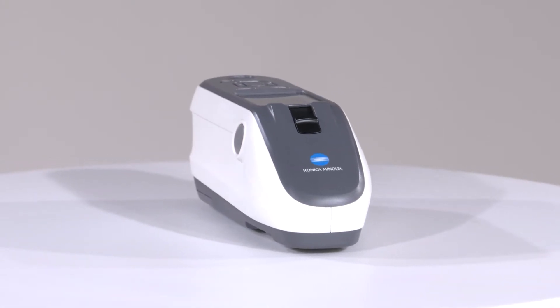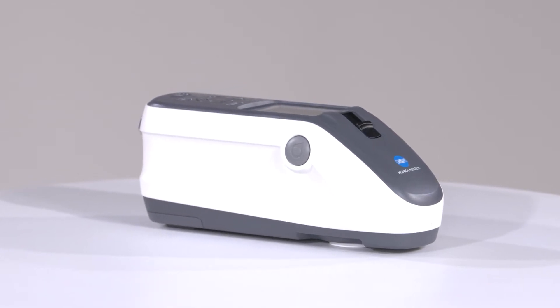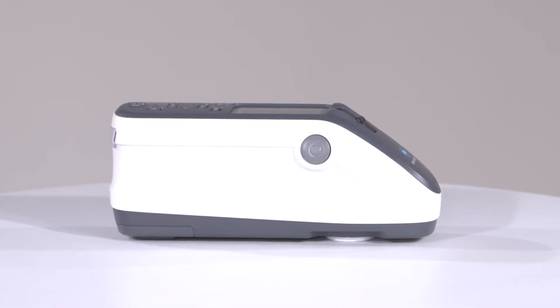The CM26DG spectrophotometer from Konica Minolta Sensing is a highly accurate, easy to use instrument that allows users to measure color and gloss in the same reading.